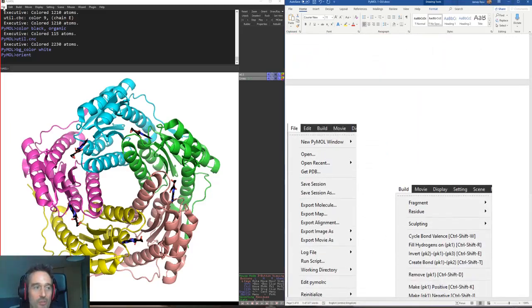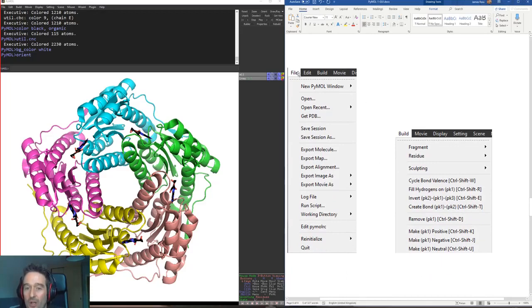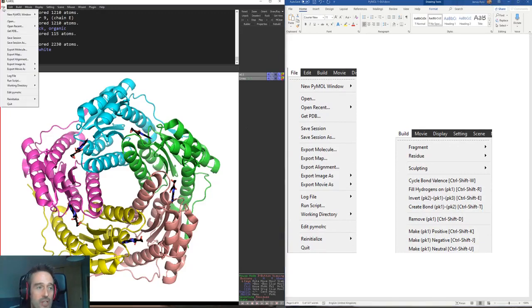In the last 9 minutes, providing you are all still awake, I thought I'd go through some of the other features of the GUI, which just revolves around these menus up at the top here. The file menu: open, close, save. The only thing of particular interest for you here is to do this.